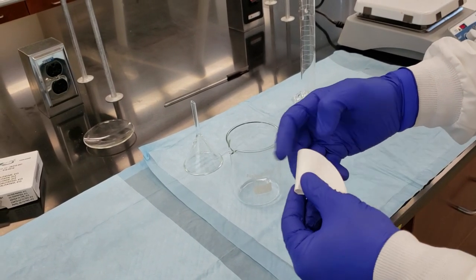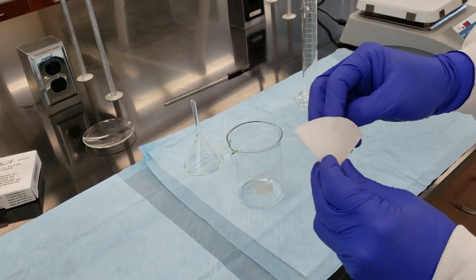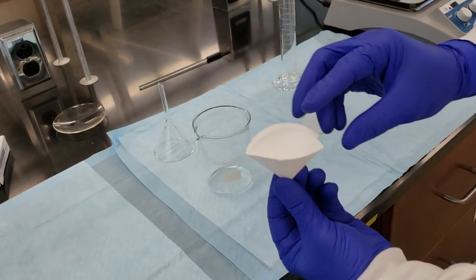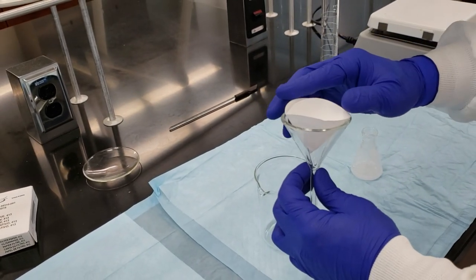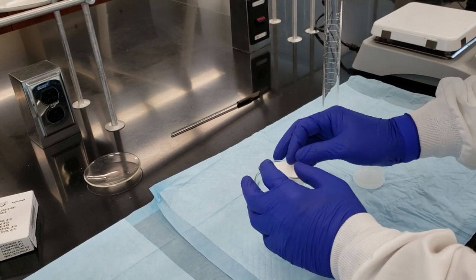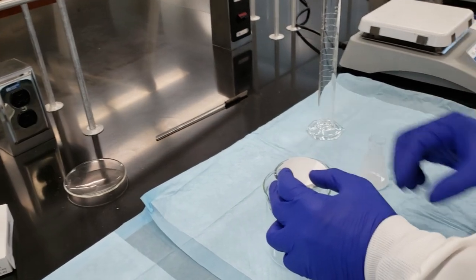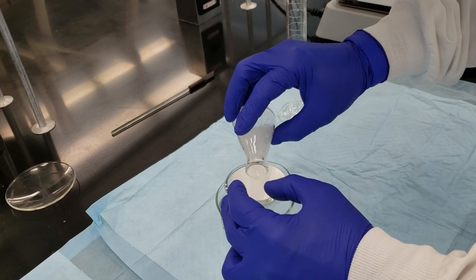So I'm going to fold my filter paper. This is a fluting of our filter paper. Fold it into quarters. Then we take one of our flaps to make this nice cone shape. Take our short stem funnel, place that cone into the funnel, and set it down. That's our hot plate. It's been warming up. I'm going to hold this with my finger for the initial filtration here. We'll swirl this and we'll pour our mixture through.